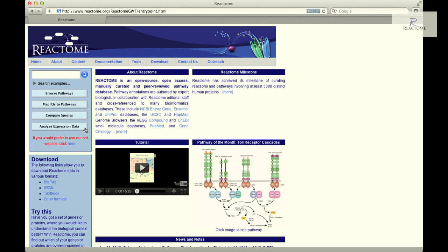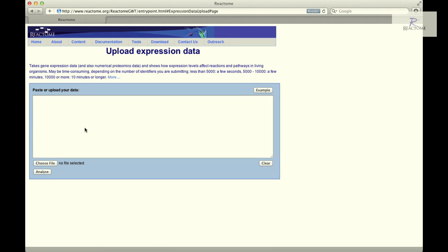In the sidebar of the Reactome homepage, click on the Analyze Expression Data button to launch the data entry page for the expression analysis.